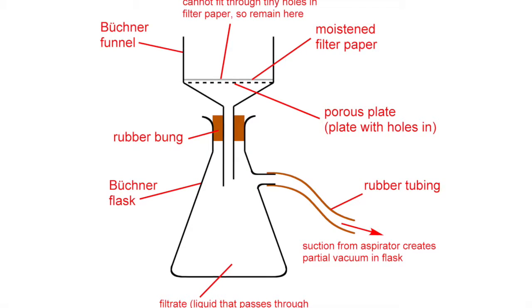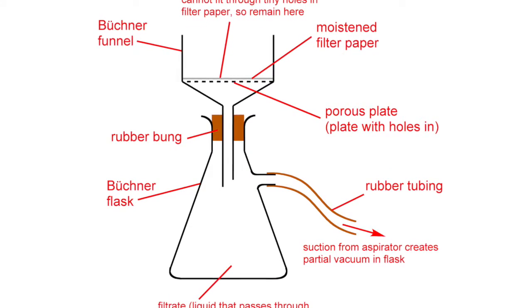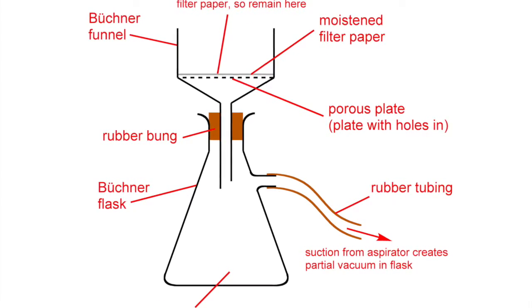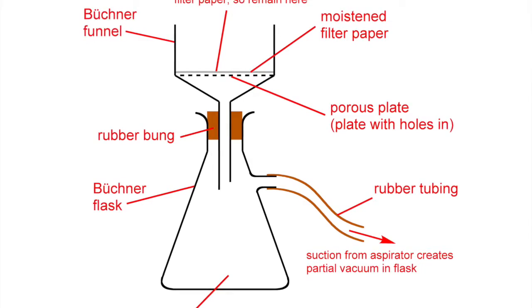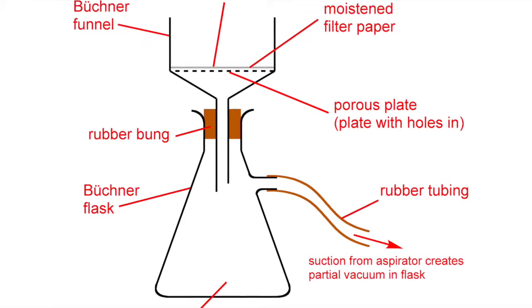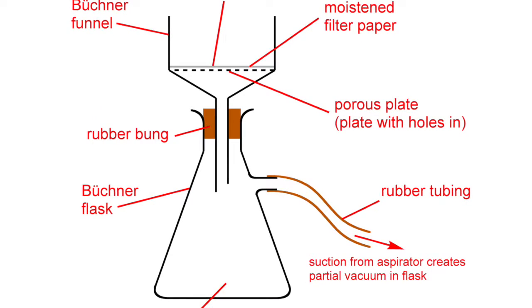After the foil's dissolution, these ions were also accompanied by large solid impurities, which had to be filtered out. These impurities were removed via a few rounds of vacuum filtration. After filtration was completed, the resulting solution was clear, colorless, and ready to have sulfuric acid added.